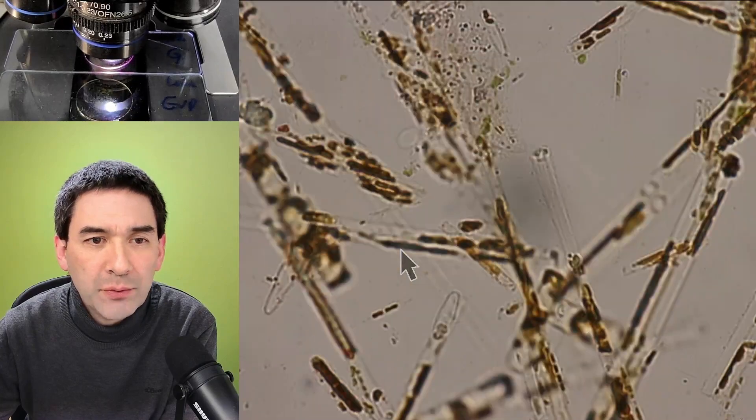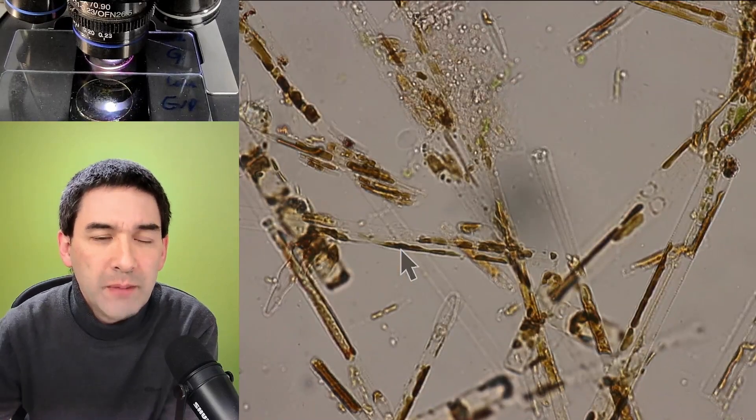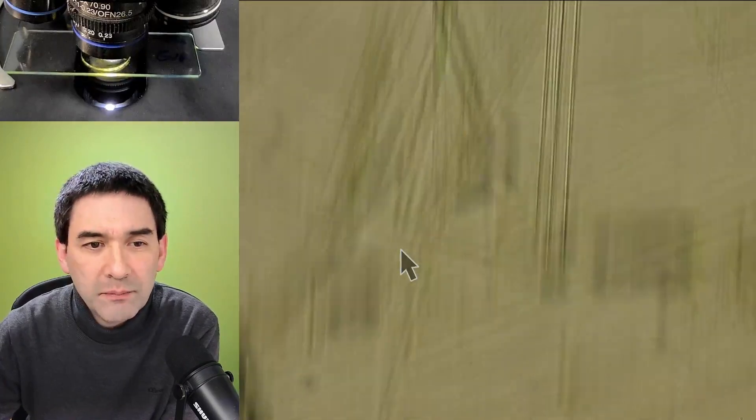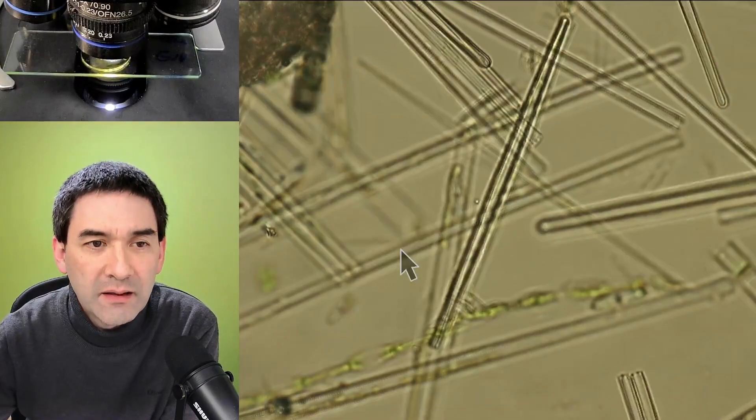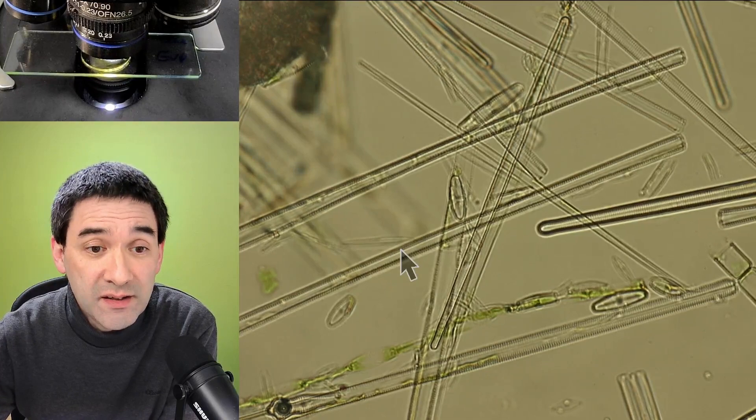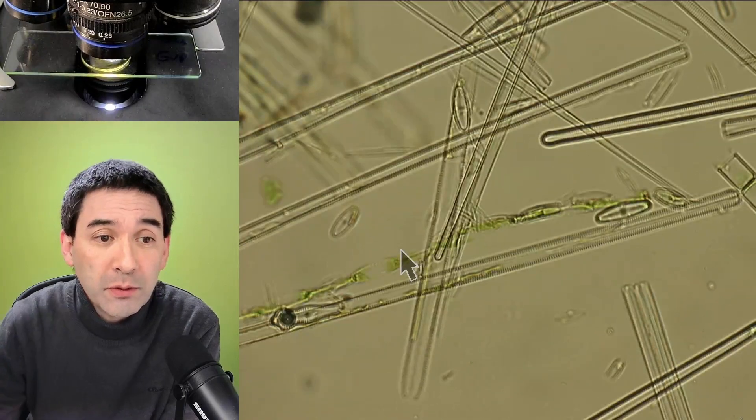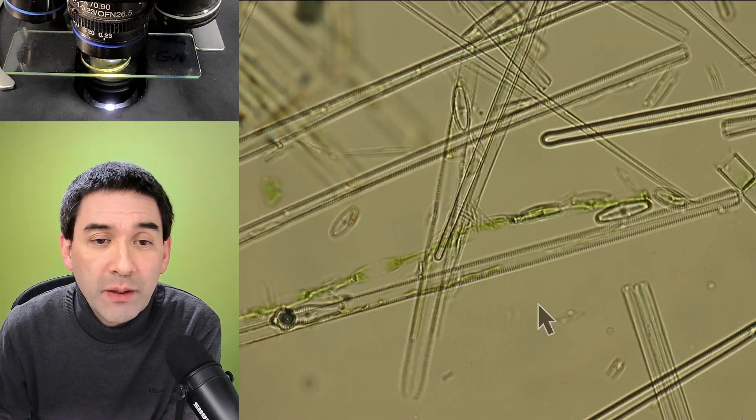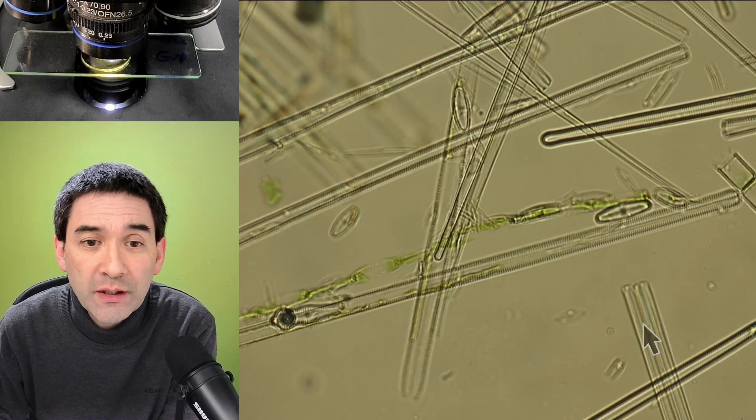Maybe you're able to see something else as well, besides the apparent lack of the chloroplasts. I'm going to explain why this is the case in just a minute. You're probably also going to notice that the background is quite a bit more greenish yellowish than the specimen mounted in glycerin gelatin.